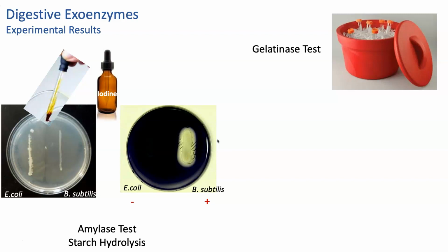Remember that in your manual, you're going to use the controls that I list here on this experiment. What do you think is going to happen to the gelatin if it's been incubating at 37 degrees for a week and a half? 37 degrees is very warm, right? What's going to happen to the gelatin? It's going to melt. It's going to be liquid.